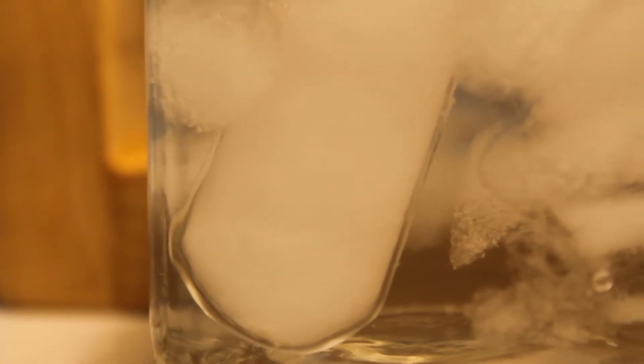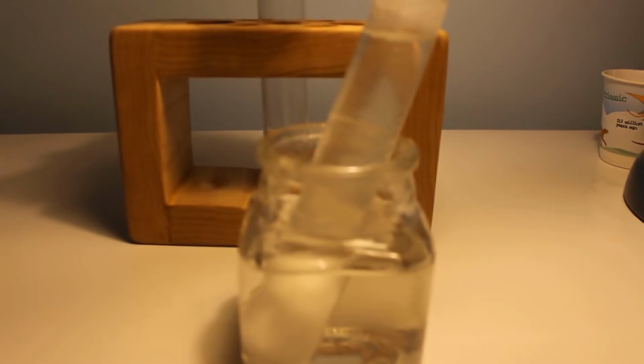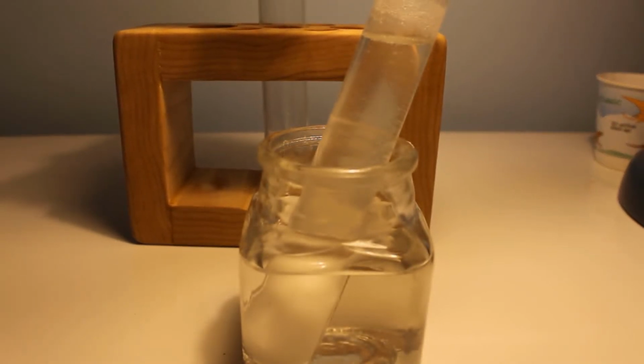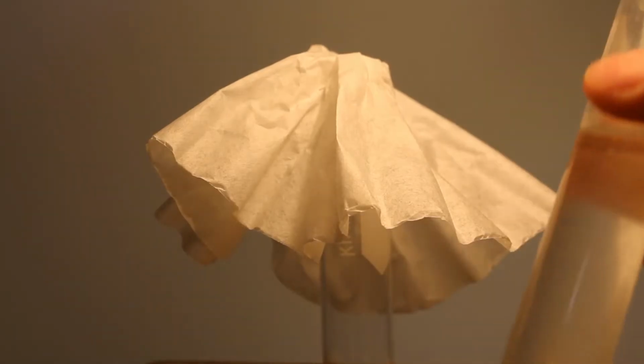The crystallizing has begun. Okay, the solution is finally ready. You can see a little clump of the salt down there. So now that we have everything set up and ready for assembly, it is time to pour it off and retrieve our sodium citrate.